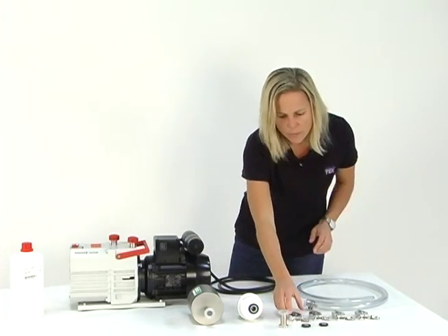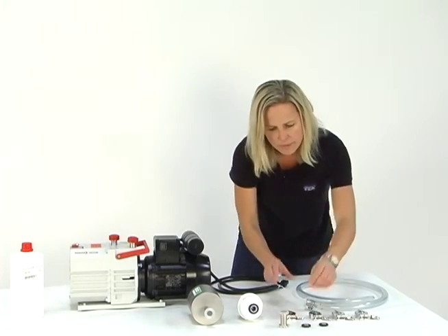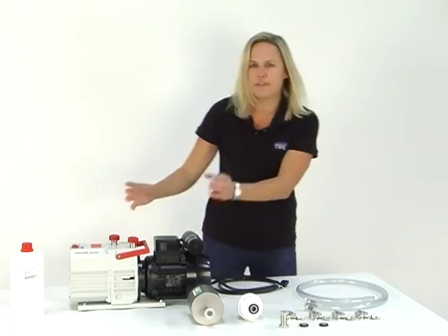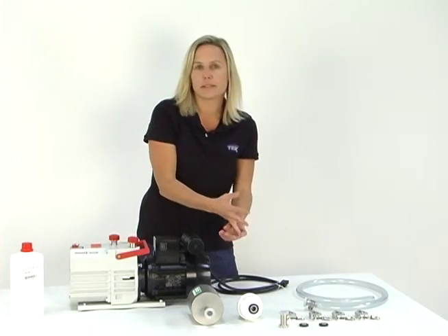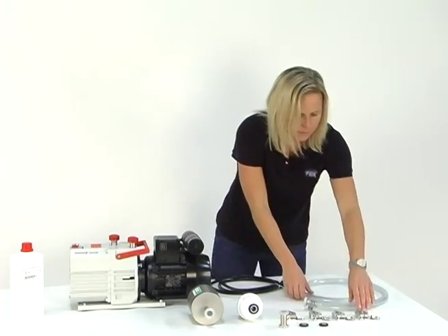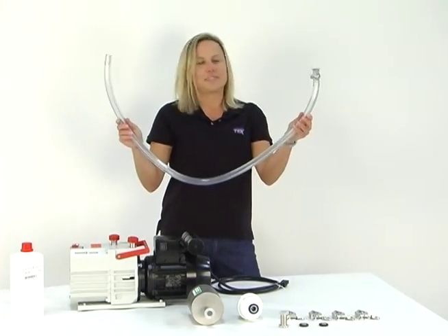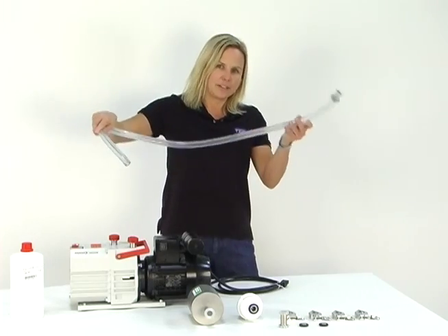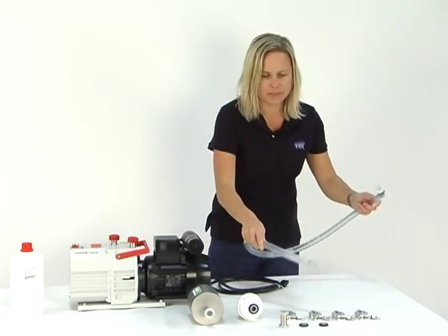These things here are what we call clamps and centering rings. These are used to affix the four-line trap and the mist eliminator to the pump, and I'll show you how to do that in a second. This is the vacuum hose — this connects to the pump and to the oven with these clamps and centering rings.